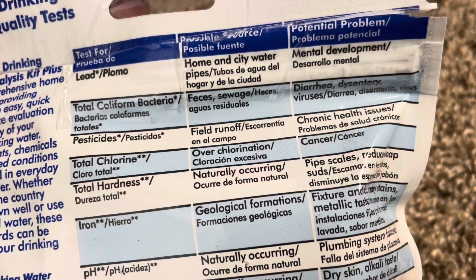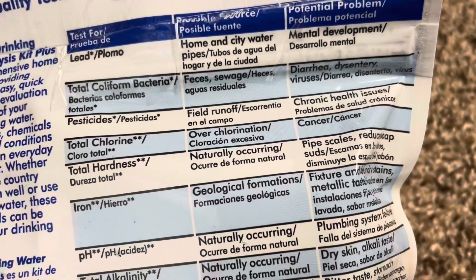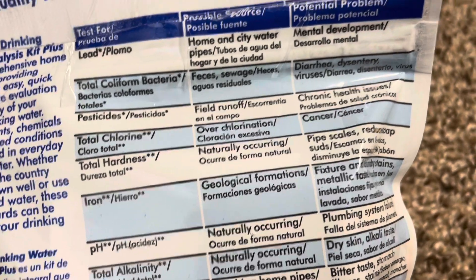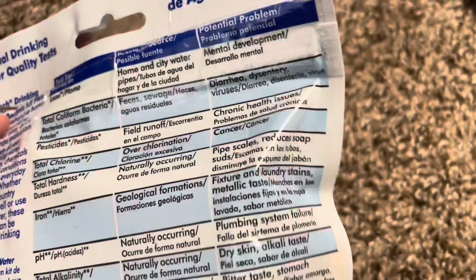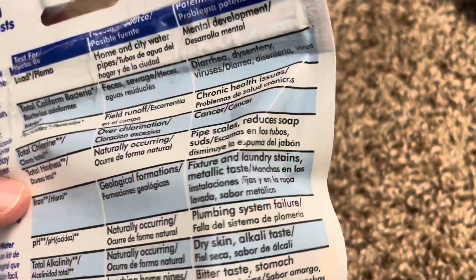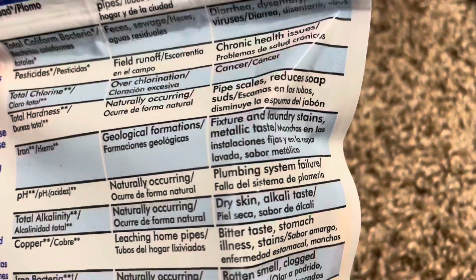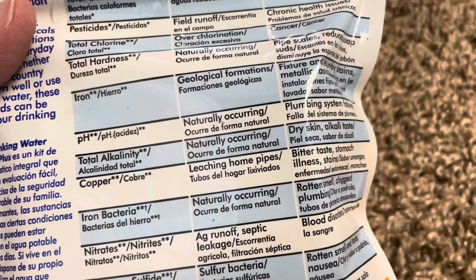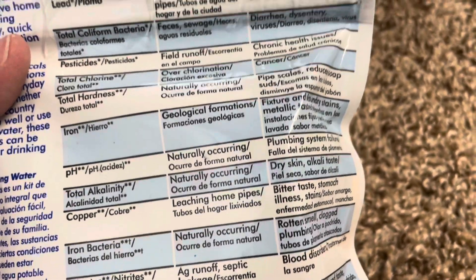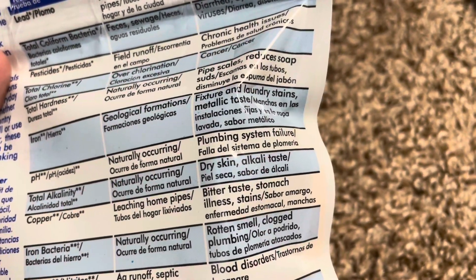Total chlorine — possible source: overchlorination; potential problem: cancer. Total hardness — possible source: naturally occurring; potential problem: pipe scales and reduces soap suds. Iron — possible source: geological formations; potential problems: fixture and laundry stains, metallic taste. pH acidity — possible source: naturally occurring; potential problem: plumbing system failure.